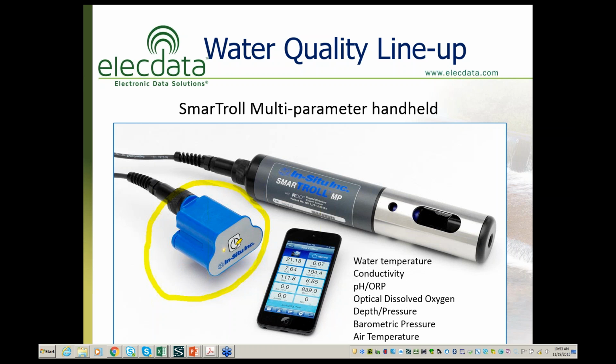and just simply has one key. You turn it on or off with an LED light that shows you if it's powered up and if it's communicating or paired to your Bluetooth device.